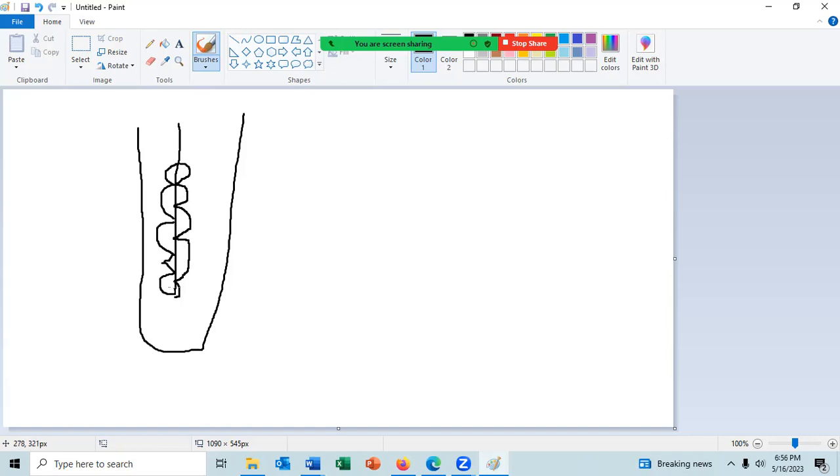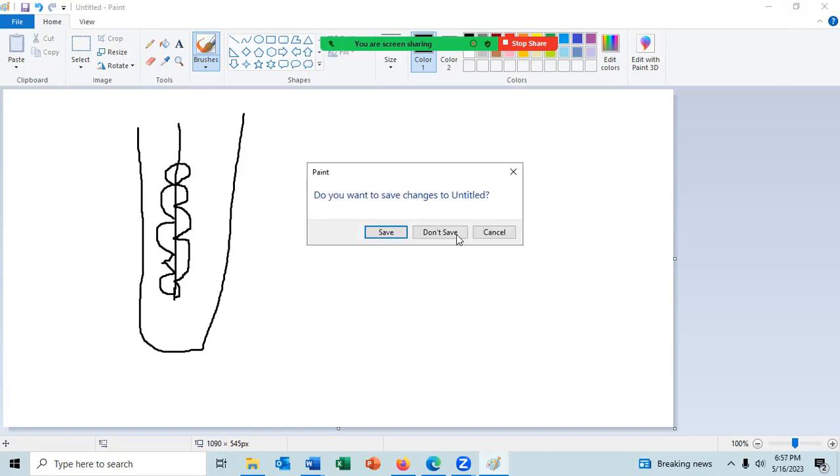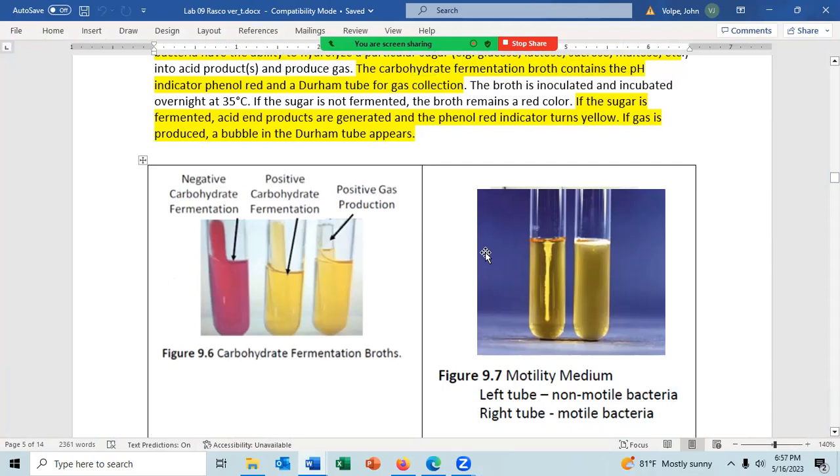And so if you see something like that, this will be also motile. This is slightly motile, a bacteria that can swim a little bit because it has a flagella or flagellum. And this is highly motile. The bacteria has swam everywhere in the tube. Any question about that? Both of them would be motile positive. This is motile negative, where there's only growth in the stab.